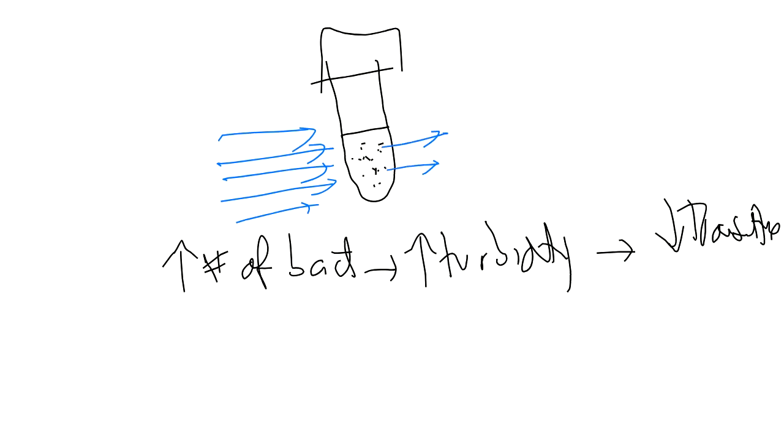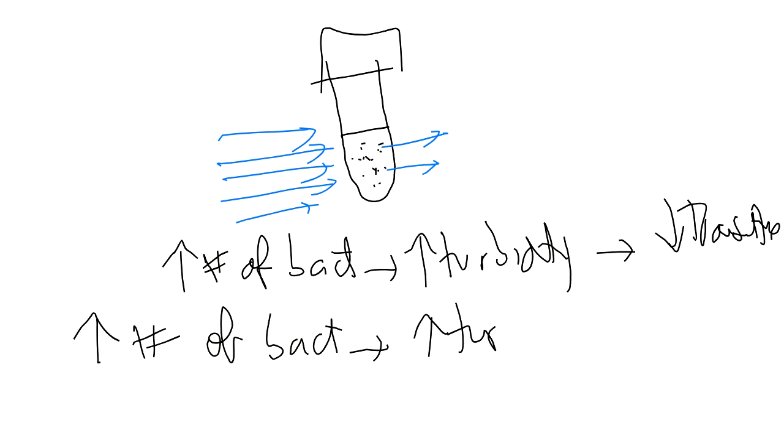On the other hand, if you measure absorbance, then the higher the number of bacteria, the higher the turbidity of the sample, the higher the absorbance.